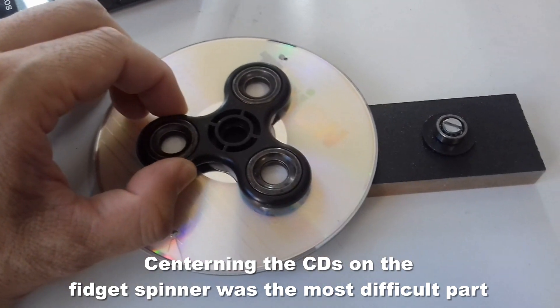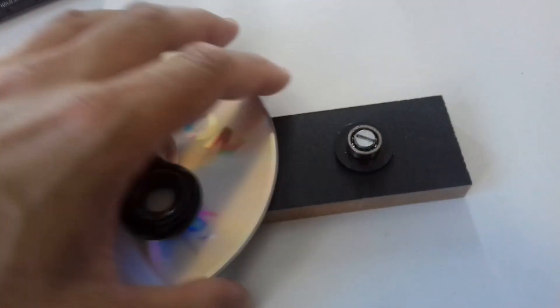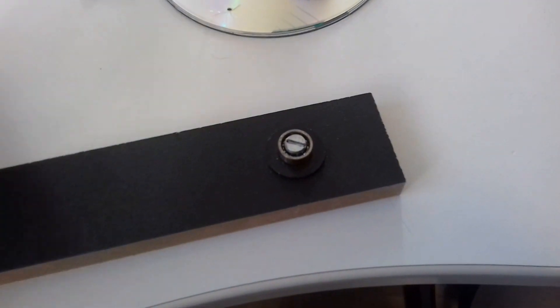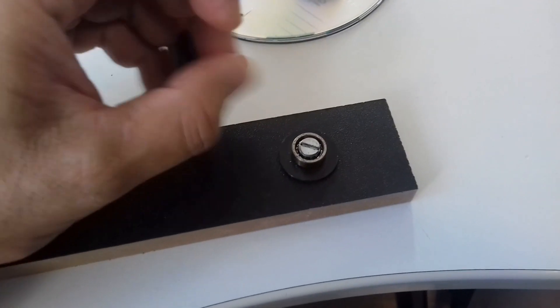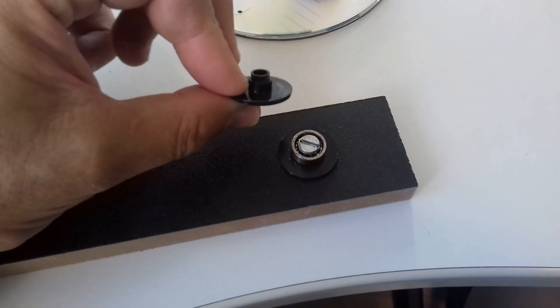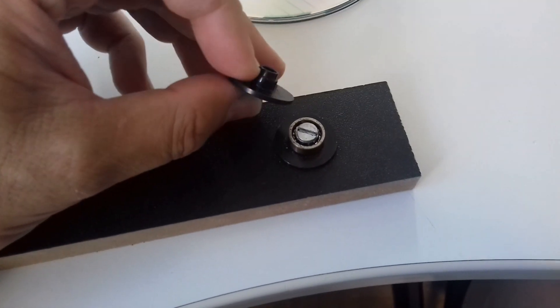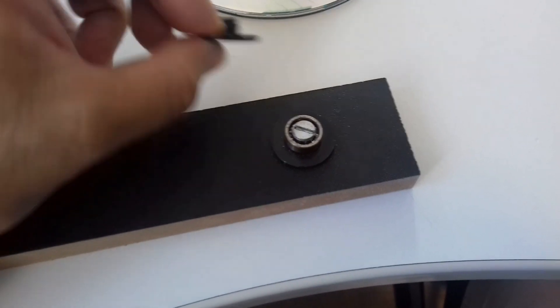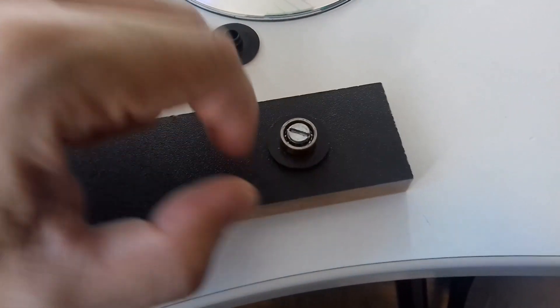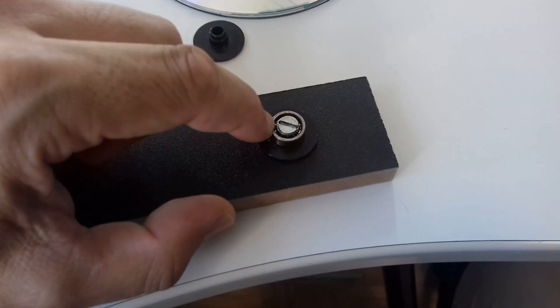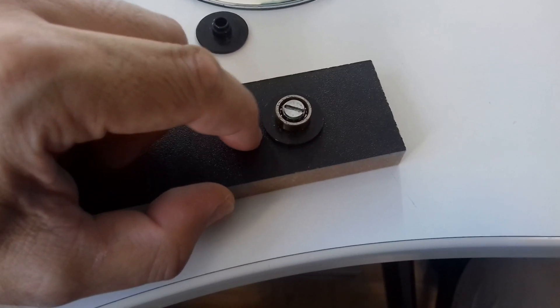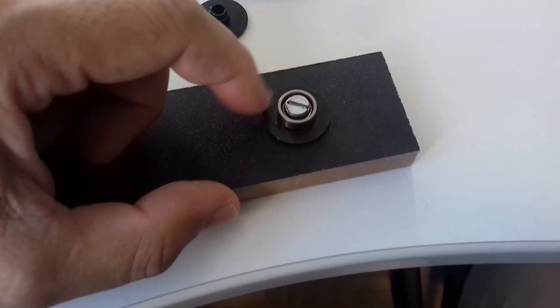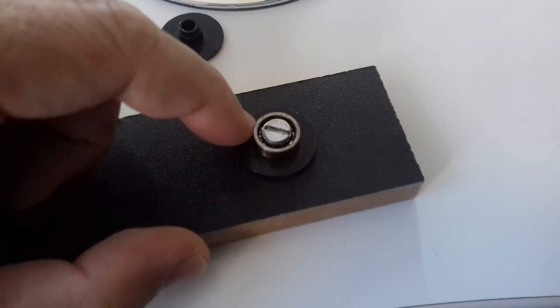The ball bearing has two plastic caps on both sides of the fidget spinner that are held together by friction and can be separated quite easily. One of them I mounted to the wood using a screw. The screw also holds the ball bearing in place, and it's rotating quite freely.